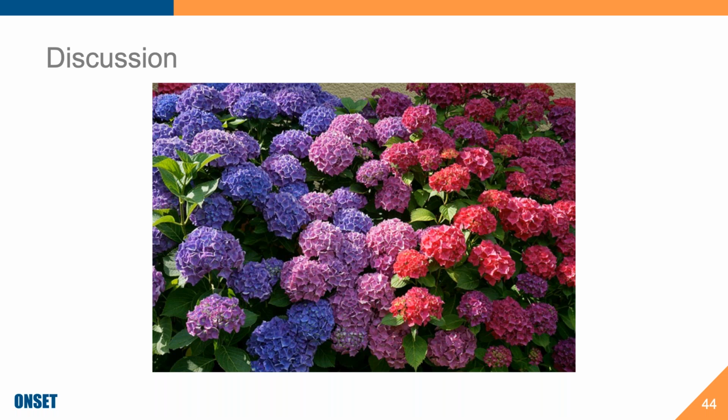So that's because they're looking for incredible accuracy. When we're deploying a pH electrode either on a multiparameter sonde or a data logger for long-term studies, we aren't expecting, hopefully, that it is reading to 0.001 degree of accuracy. So with that in mind, yes, you could probably go longer than 7 days.